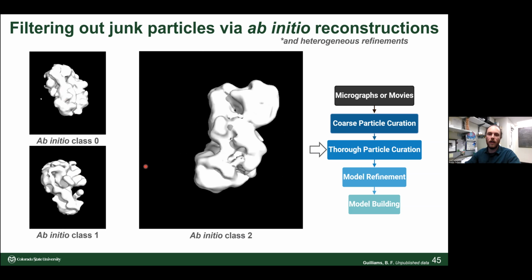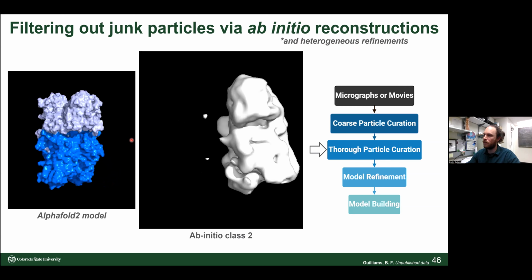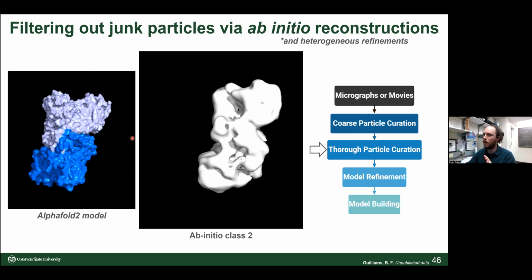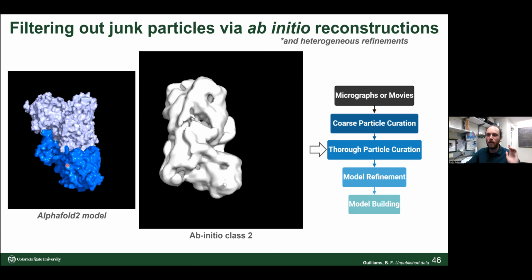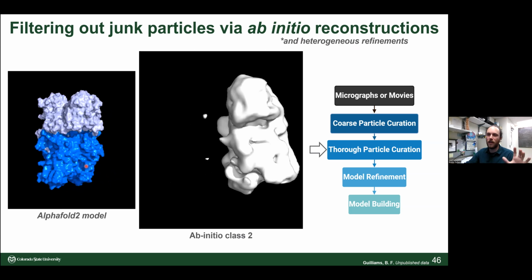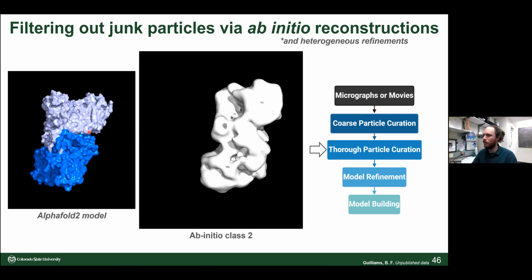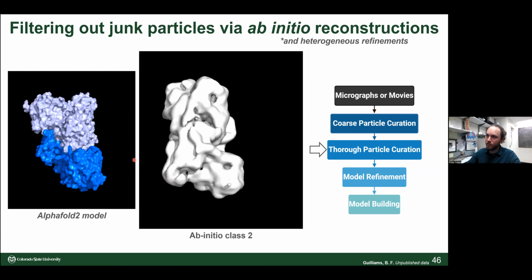Okay, and we compare this to the AlphaFold model. I know the rotations aren't quite aligned here, but you have to trust me, it is looking like this model, right? The model shouldn't be ground truth, and I'm not trying to treat it as such, but it is a reference point as I'm figuring out what I'm doing here, right?